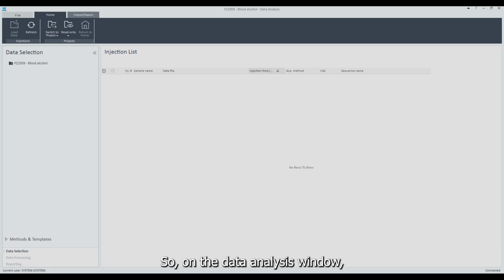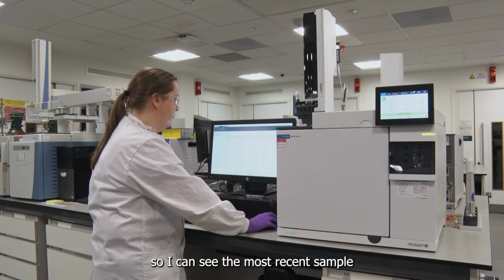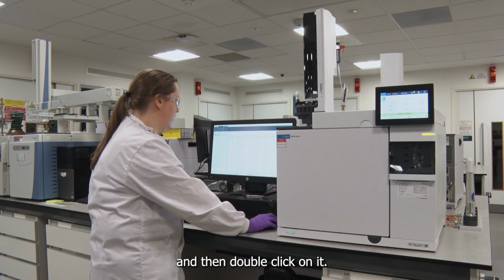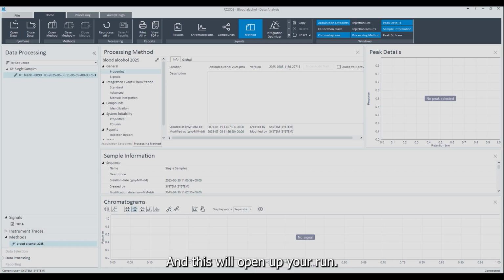So on the data analysis window, you want to click on data selection, and this is where your method is. And as soon as you click on that, that will bring up all of the samples that have been run on this method. I order it by injection time, so I can see the most recent sample, and then double click on it, and this will open up your run.